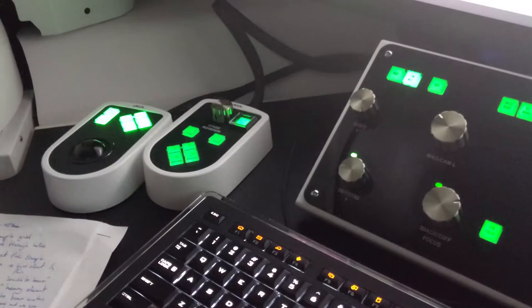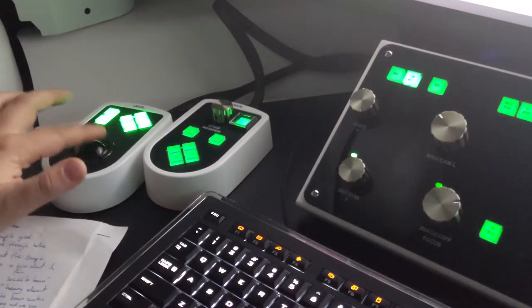this ball here, which moves the sample around. If I just focus. Yep. So with the trackball, I can move the sample around.